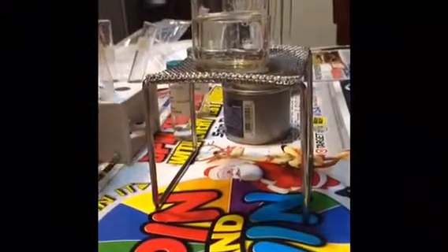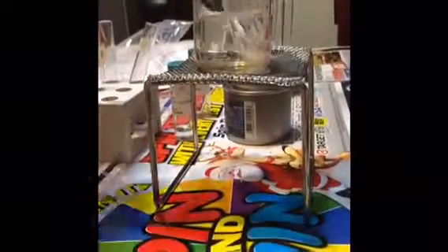Now I'm gonna put in my test tubes. Five minutes, counting. Up. Let's see what we can get out of these mixtures.